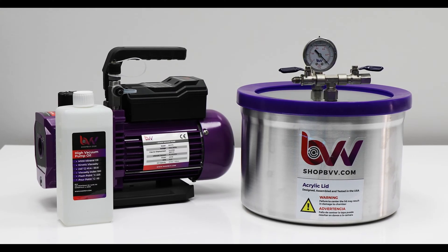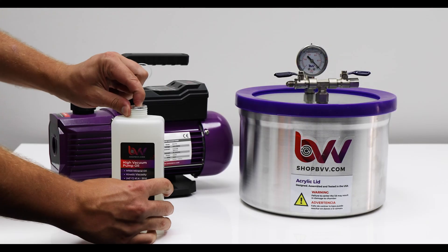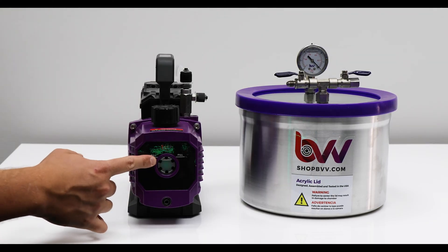How to set up a BVV vacuum chamber and pump kit. Start by opening your bottle of oil. Take the cap off of your oil fill port on the vacuum pump. Add oil until it's to the max fill line and then replace the cap.